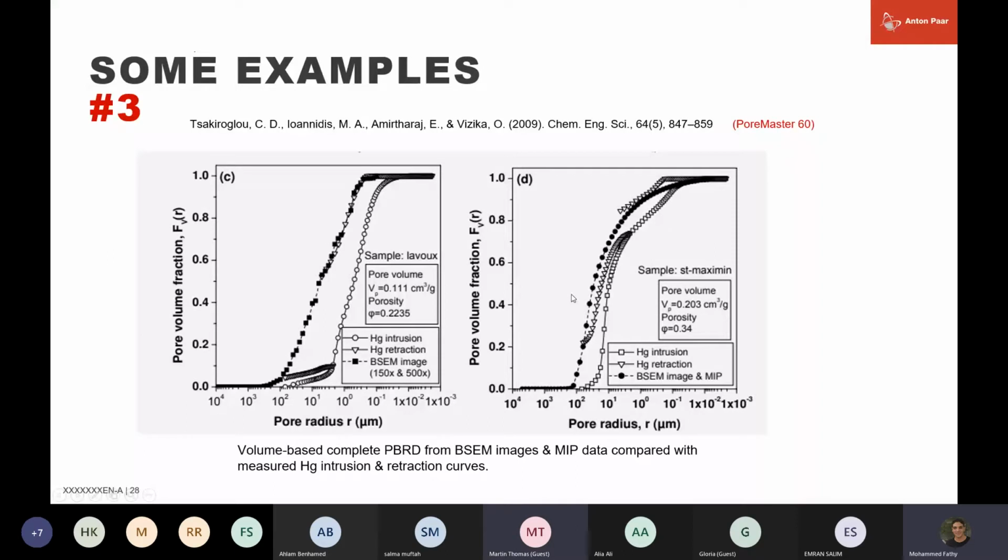Okay, so if you're into complex modeling, you can do a lot of interesting work by changing the pressure at which you end the intrusion and start to come back out. So obviously the normal way to do this, you could intrude up to this pressure, come back down, go a little bit higher, come back down, go a little bit higher, come back down, and so on.